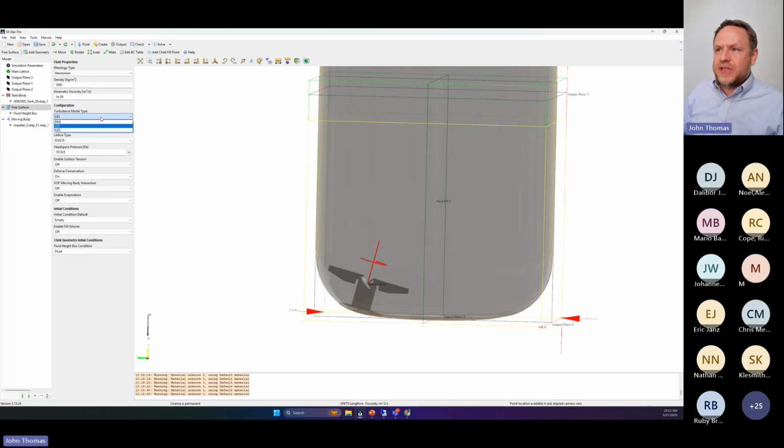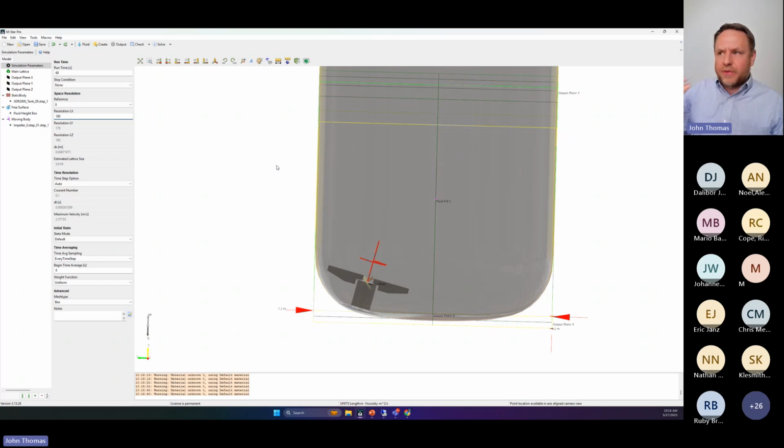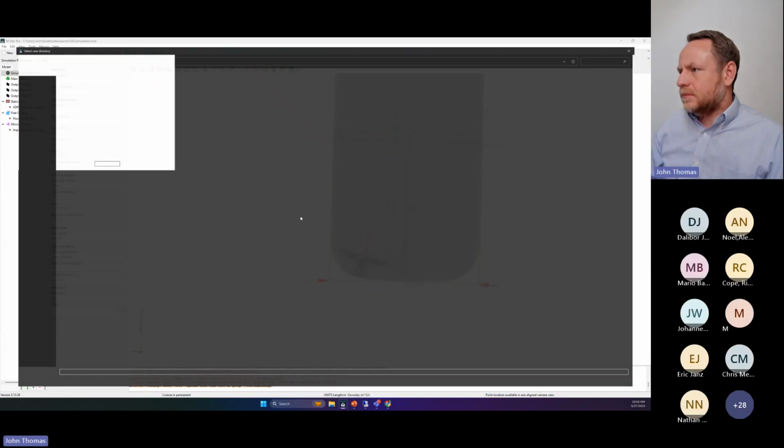I'll use LES versus ILES or DNS. I'll go ahead and model this as a Newtonian fluid, and I'll give myself a decent resolution. I'll go up to like 180 or so. We'll talk about this point later, but this informs the smallest eddies I can resolve inside my system. Said again, when I run this guy, I'll hit go here and we'll start cranking the data.